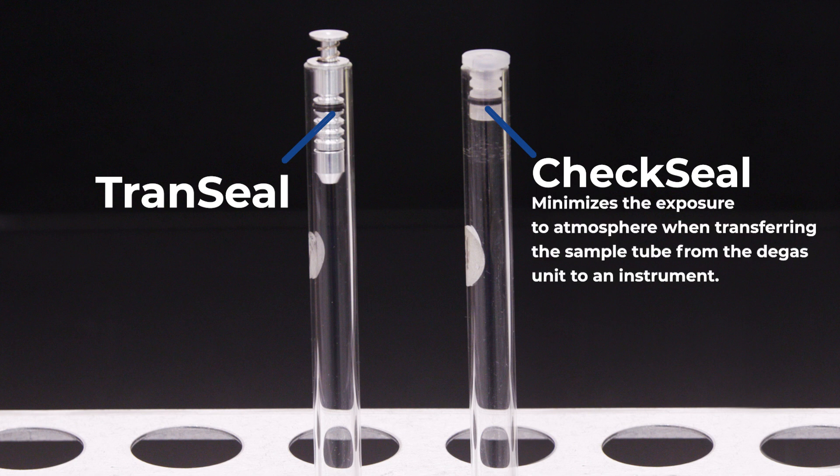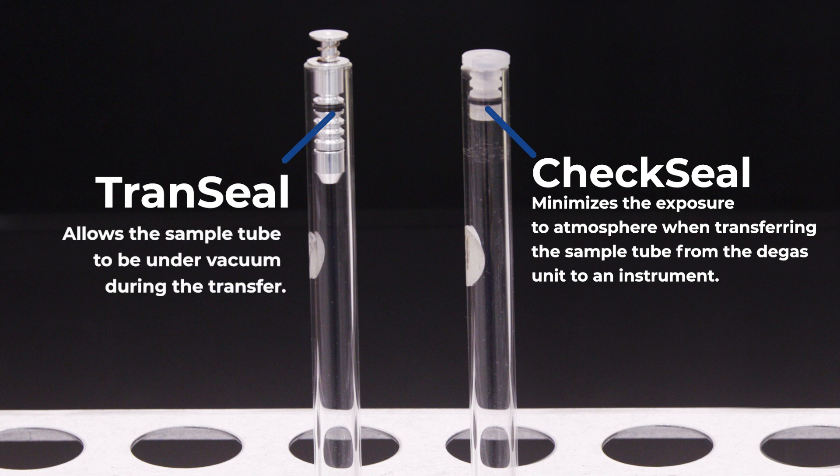Check seals minimize the exposure to atmosphere by sealing the opening of the tube when it is being transferred from the degas unit to an instrument. Trans seals allow the sample to be under vacuum during the transfer.